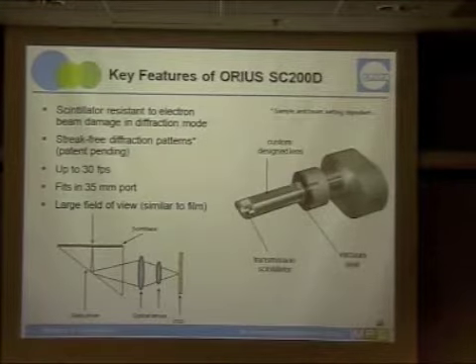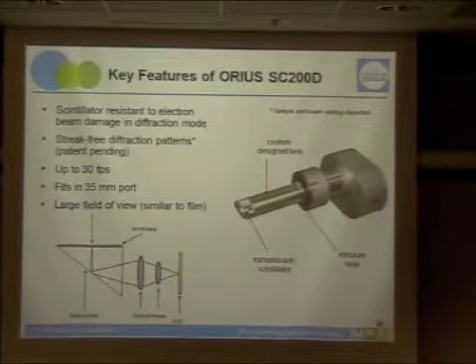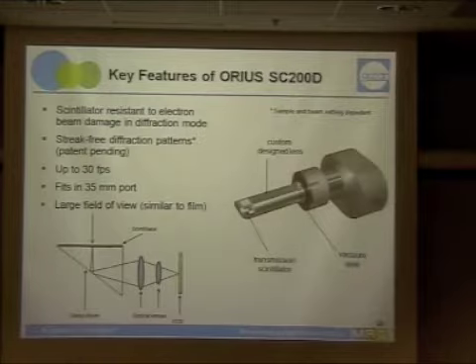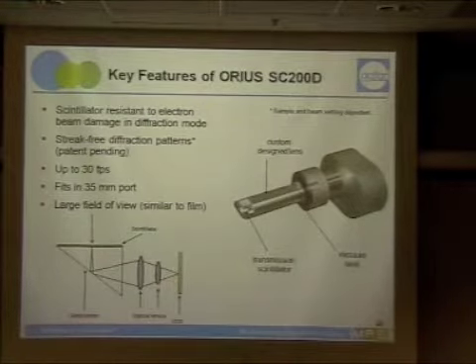Okay. What is the size of the CCD here? So this is a 2K by 2K CCD. 2K, yeah, that's right. And 30 micron pixels? No, like 7.5. Yeah, 7, I think. Yeah, very small. So the idea is that it sits in an area that's not larger than what film would image, and that way any S-type distortions shouldn't show up. That's the idea.